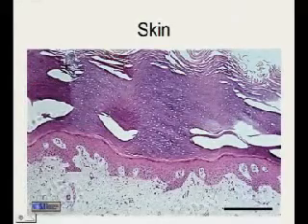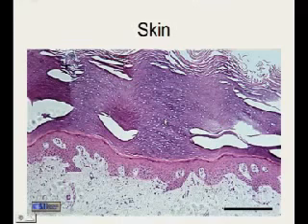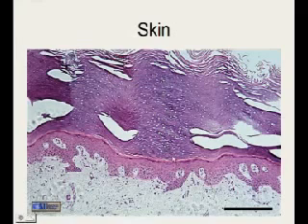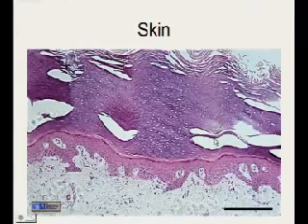Another picture, this is obviously, when we talk about the integumentary system in more detail, thick skin versus thin skin. Very thick callus layer has formed over the stratified squamous epithelial tissue. This is the surface above the layer of the stratified squamous epithelium. Again, the magnification here is not as high as we had in the previous slides, but the pattern is very typical of what you would see in skin.